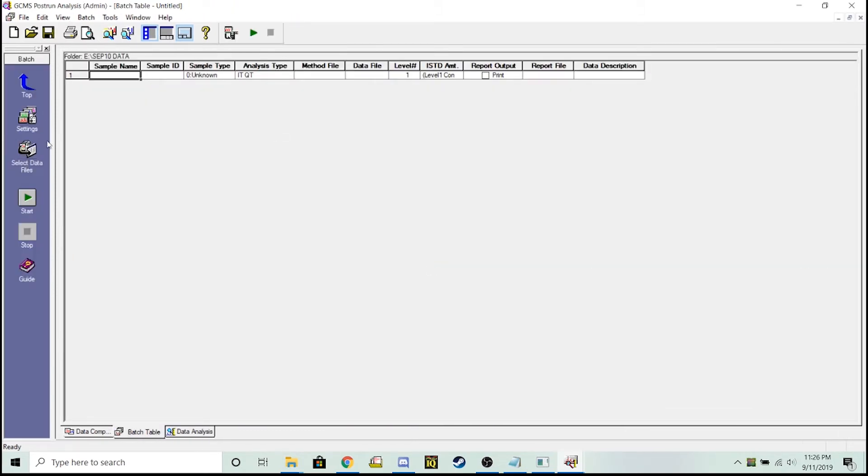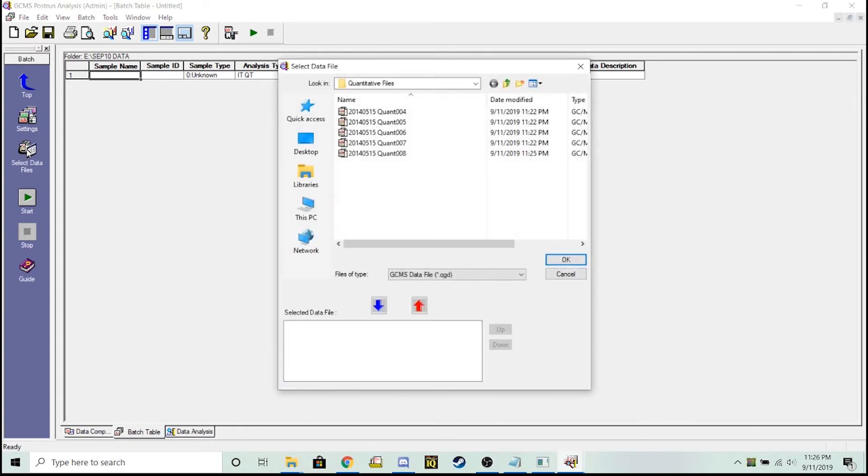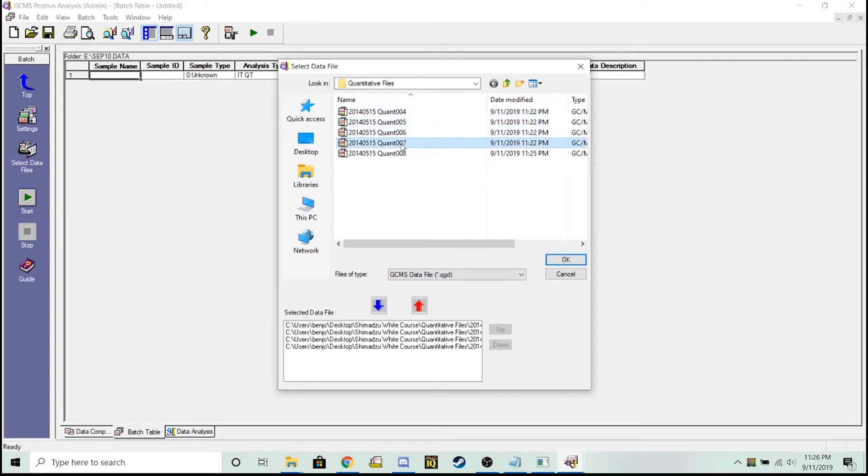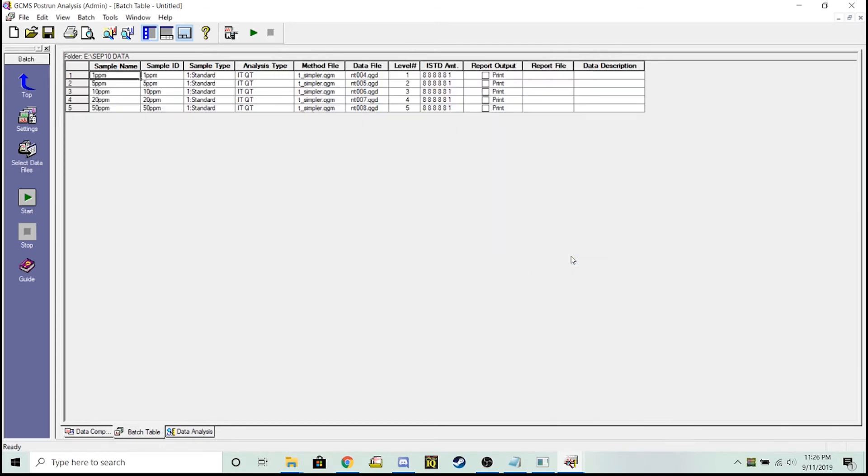I'm going to start by selecting my data files. When I do this, it's important to load them from low concentration to high just by double clicking. So I'm going to double click each one of these. Okay, looks like that loaded in just fine.